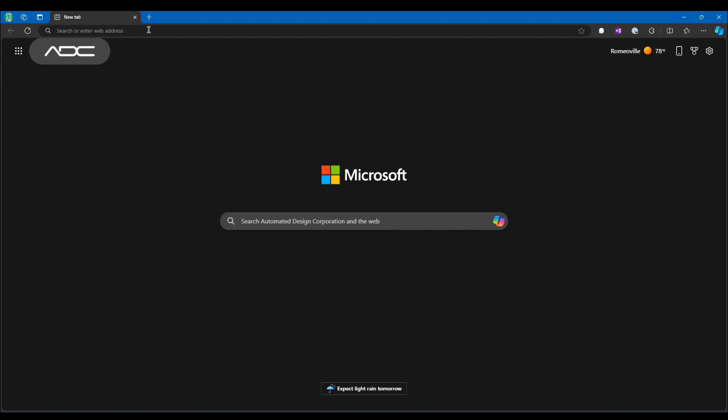To connect to the system and access the web interface, all you need is any Google Chrome compatible browser. In this case, we're using the Microsoft Edge browser, which is based off Google Chrome and is included with every current version of Windows, both Windows 10 and Windows 11.